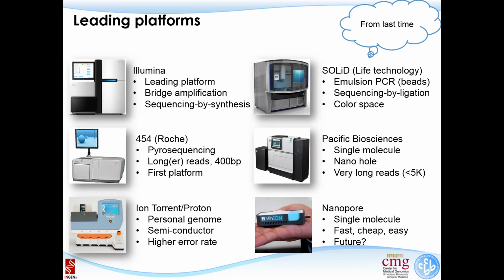And this was initially marketed as a personal genome sequencer because it's faster than anything else 5 years ago. Not anymore, because everything else becomes faster as well. But it does have some advantages and uniqueness as well.